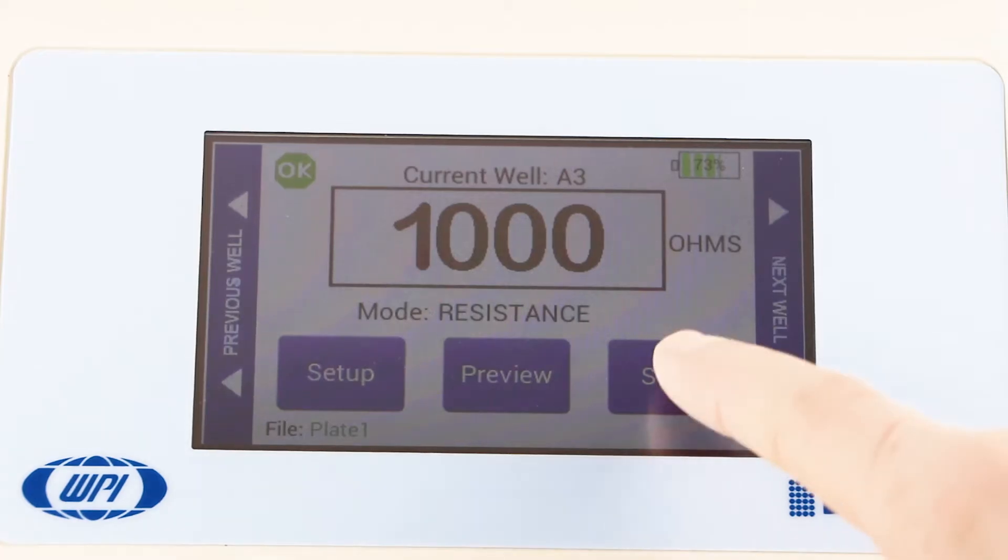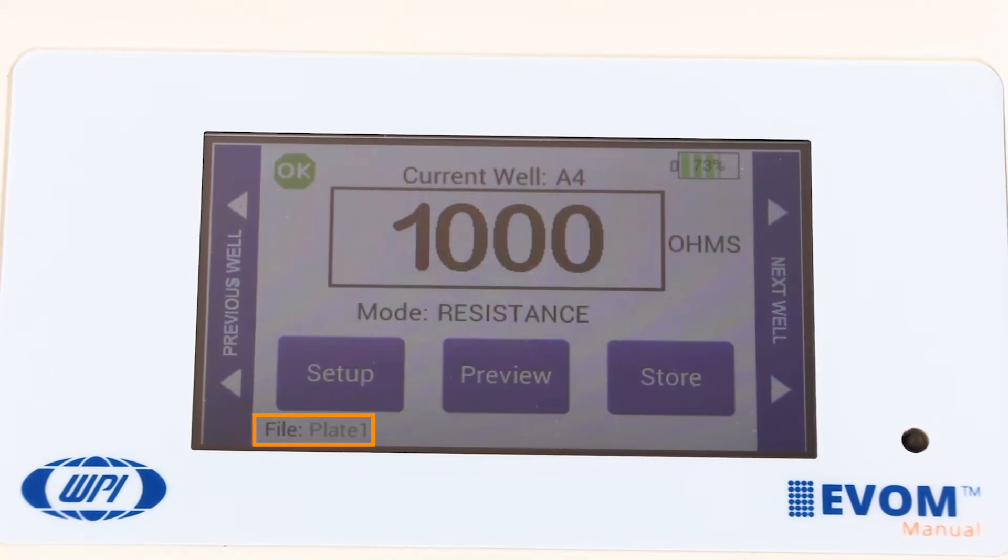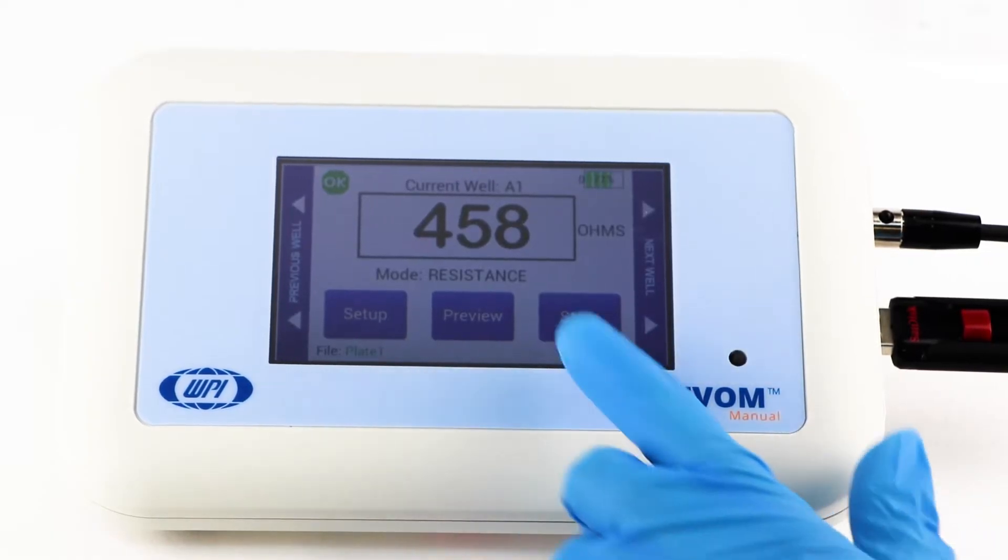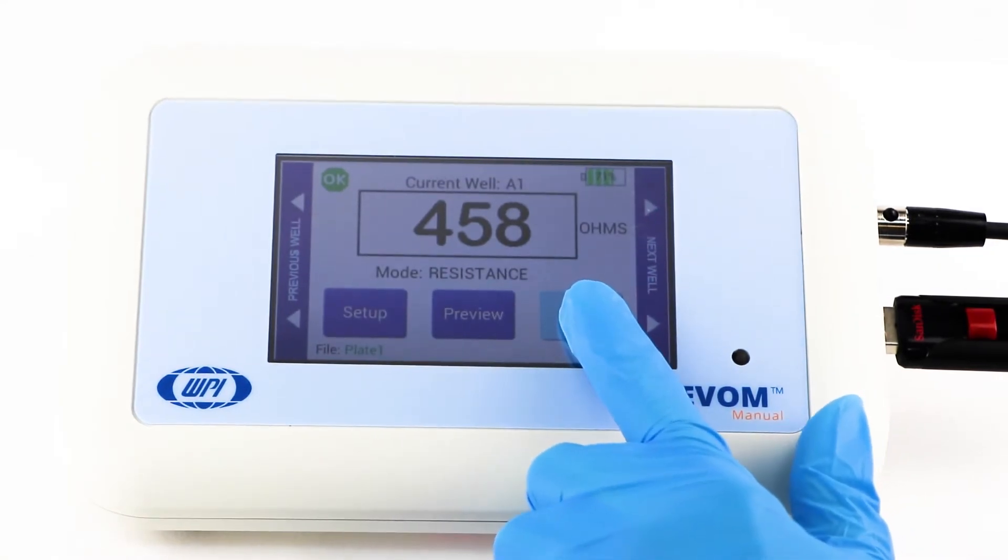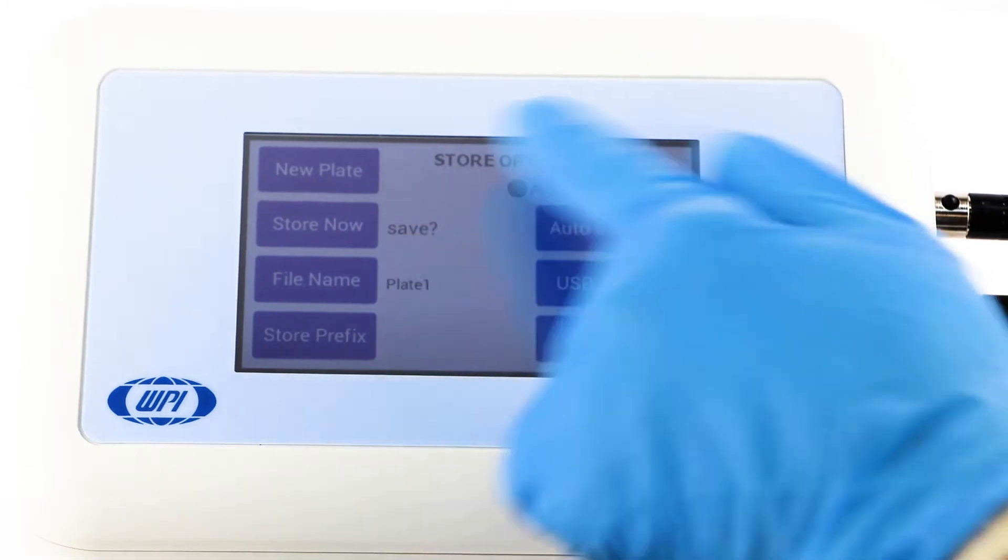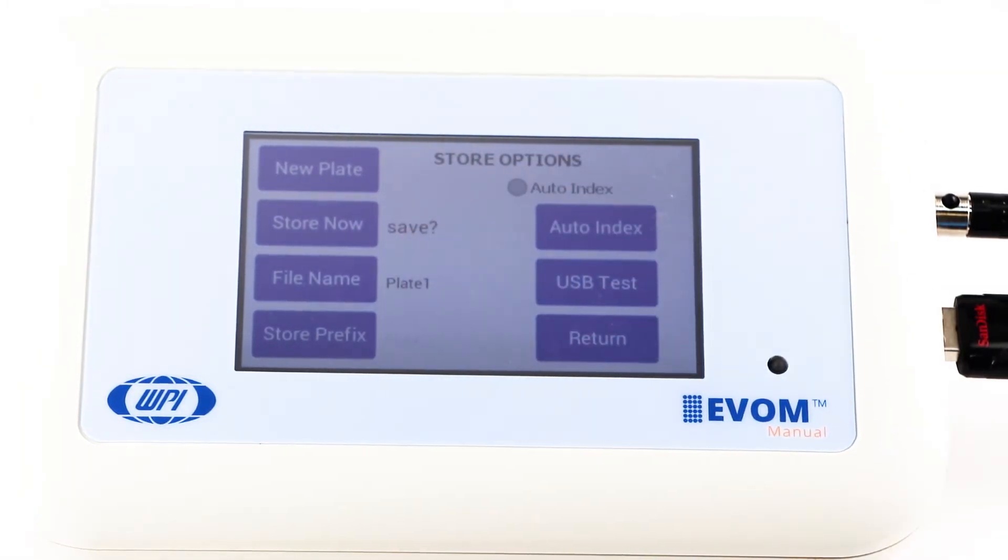By default, the file name is set to plate 1, but you may choose a prefix that auto-indexes or a unique file name. Press and hold the store button on the main screen for 2 seconds or press store screen on the setup menu to configure your stored data files.